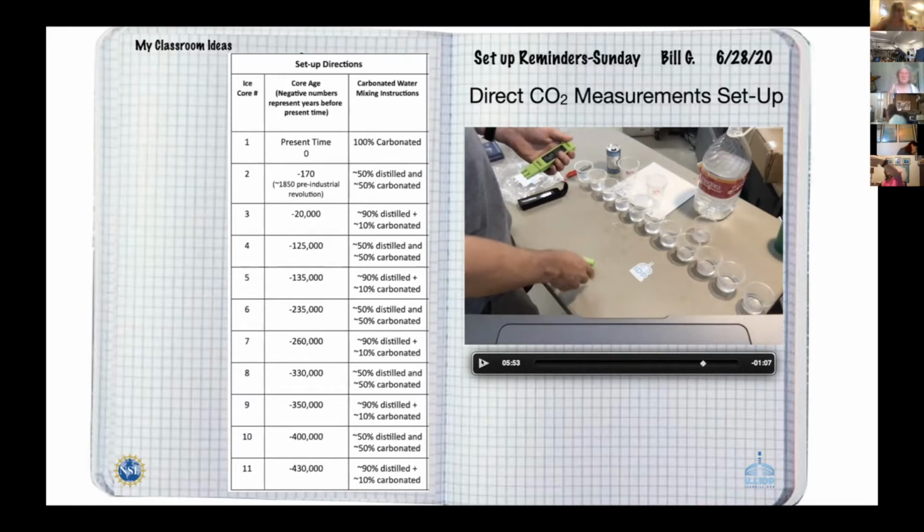So basically, everybody, we do 2, 4, 6, 8, and 10 at 50%. Exactly. Now you're seeing it. Half of them all have the same stuff. So once you mix up your master solution of 50%, you can just take that and pour a little bit in each one of those 2, 4, 6, and 8. Yep. Exactly right.